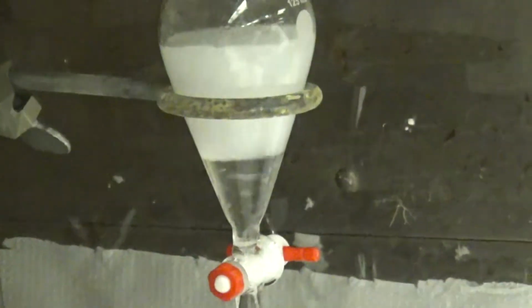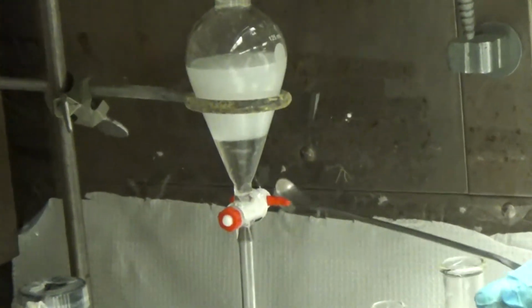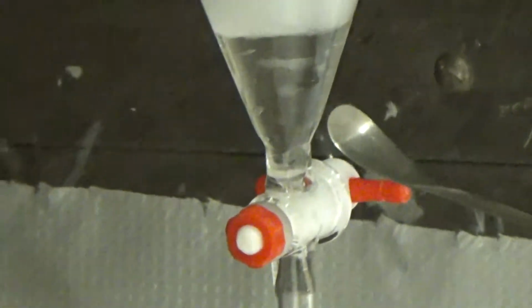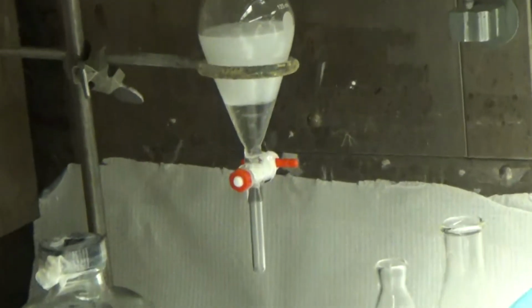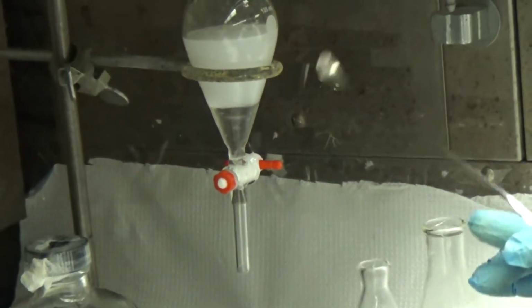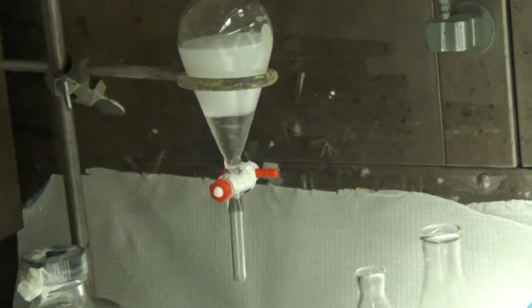And you can see the two layers, and I repeat. The organic layer is the bottom layer because methylene chloride has a higher density than the density of water. These are things you should know for the exam, things you should know in OChem 1, but also in OChem 2.